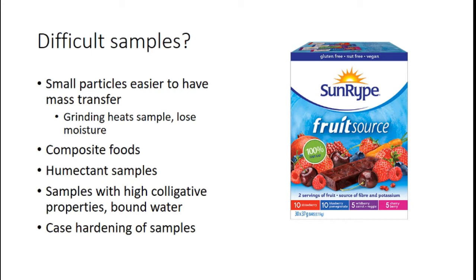In some foods, moisture migration becomes problematic. I think of a project I worked on with a frozen pizza where there was moisture migration across the different toppings, and it was very tempting to just say, well, let's measure the moisture of the total pizza. What we really needed to worry about was the moisture content of each of the individual components to identify water activity and moisture content and identify strategies to rectify the moisture migration. Composite foods are just problematic across the board. Feel free to ask me questions if you've got issues.